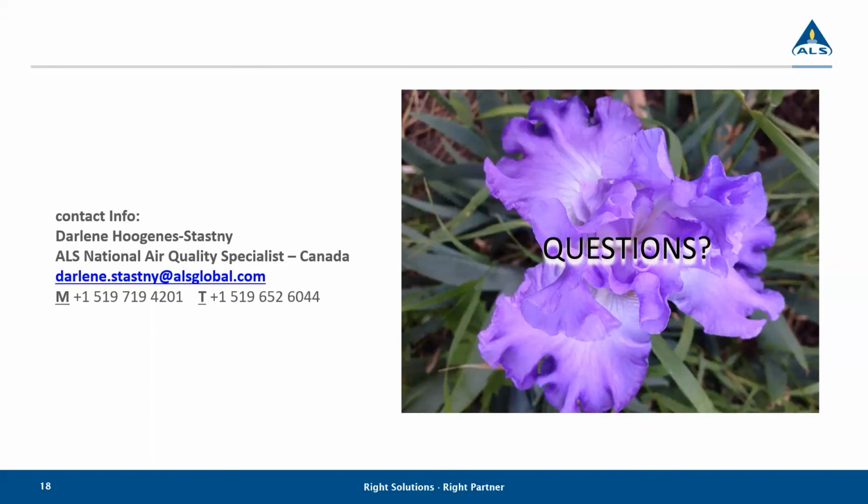I have to be honest with you, looking at volume out of the location that I mainly work with, which is Waterloo, we generally work with the passive TD tubes, and they tend to be more robust, and that's probably because they're not drawing air through them at a higher flow rate. But you are right in that the breakthrough does happen, and so we try to condition them to a point where they're usable. If they don't pass QC, and our QC is pretty strict for the active TD tubes, then we do pull them out of circulation.